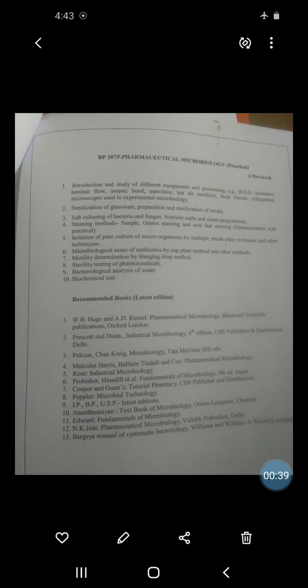Today we will see the next practical: to study the bacterial motility by using the hanging drop technique, or hanging drop method. The aim of this practical is to study bacterial motility using the hanging drop technique.